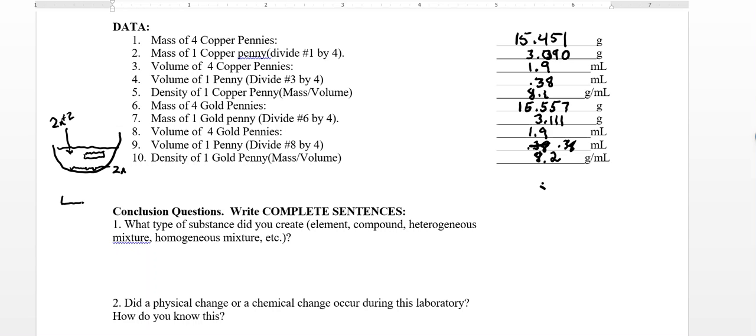So inside the solution, when it appeared to be silver, actually you had a copper penny with a surface of zinc, a very thin surface, like maybe a few atoms thick worth of zinc on the surface. So at this point, before you heat it up, you have a heterogeneous mixture, right? With mostly copper inside and a zinc coating. It is not distributed evenly throughout.